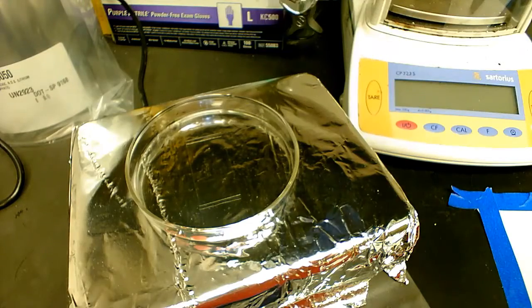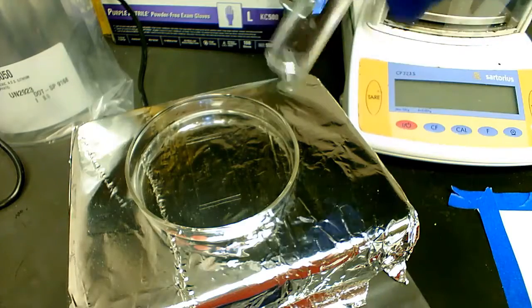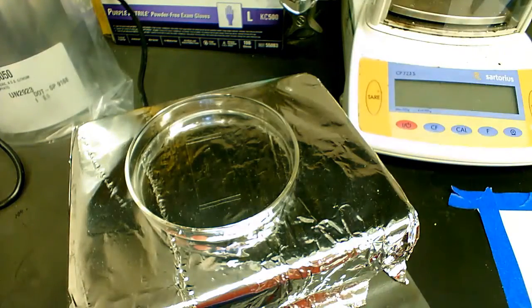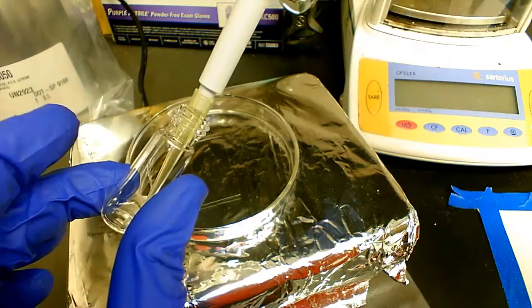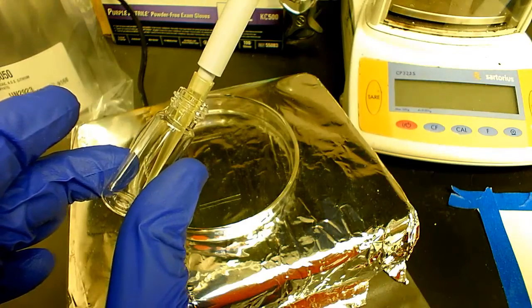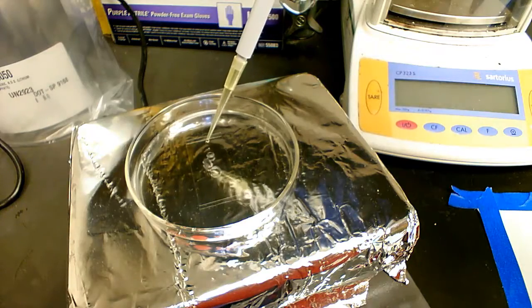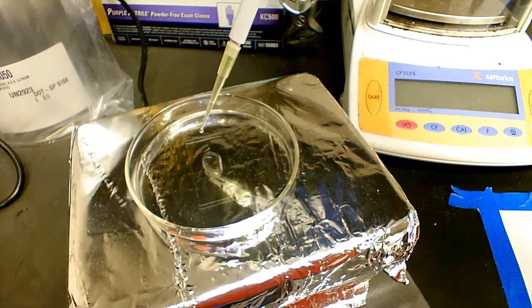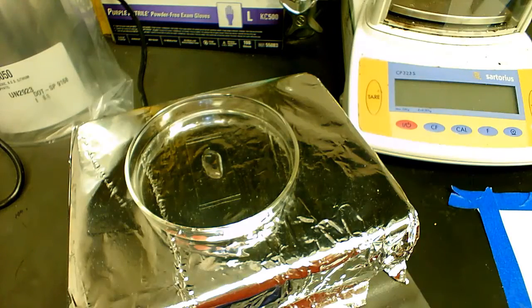Right. Next, you're gonna take the dye-doped polymer solution we just prepared, 200 microliters of the PO stock plus 1 microliter of the 200 nanomolar SRB dye solution. You're gonna take out the entire 200 microliters and just spread it uniformly on your glass cover slip like that. Right. And now we're gonna let it sit until it's dry.